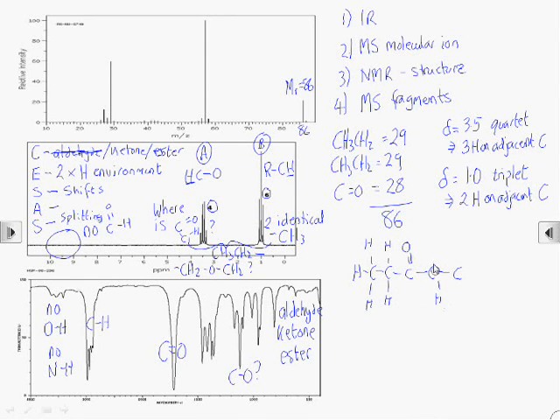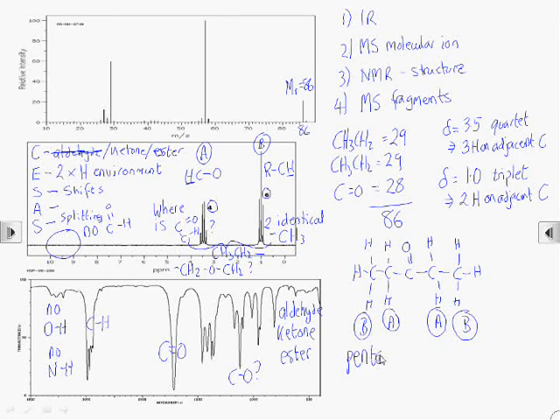What we really need to do though is to verify this using the mass spec fragments. Ethyl groups would show up at 29, and we've got a big peak there. And an ethyl group with a carbonyl attached to it, a CH3CH2CO plus fragment, would show up at 29 plus 28 is 57, and we've got a big peak there. So it looks very much as if the molecule we're solving for here is pentan-3-one.